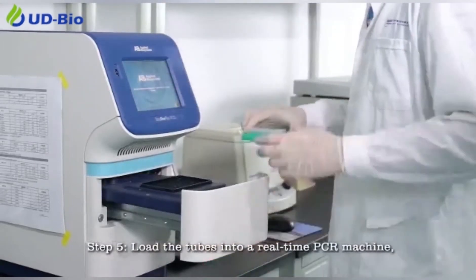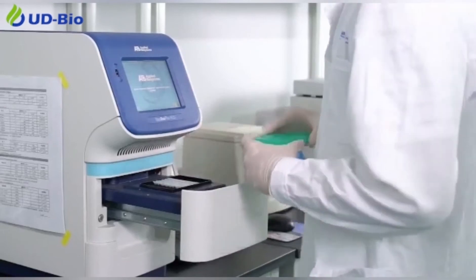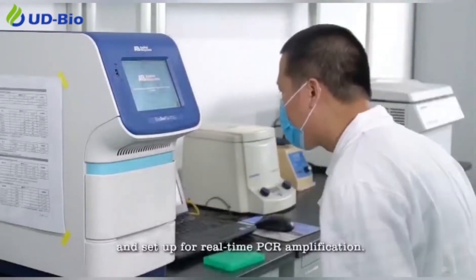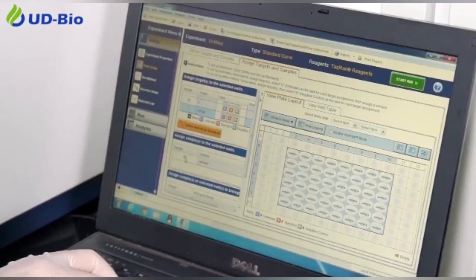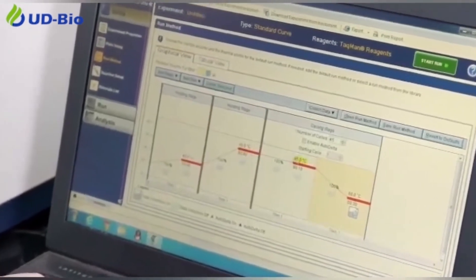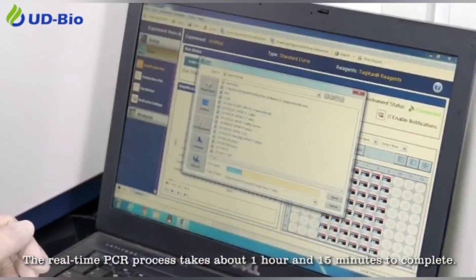Step 5: Load the tubes into a real-time PCR machine and set up for real-time PCR amplification. The real-time PCR process takes about 1 hour and 15 minutes to complete.